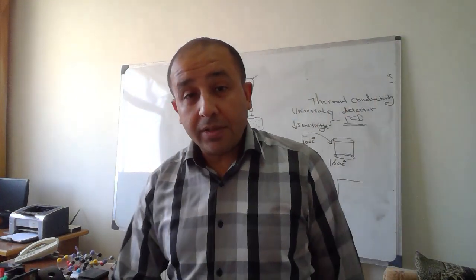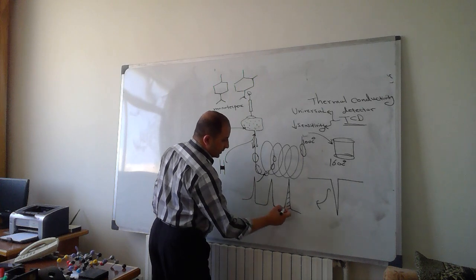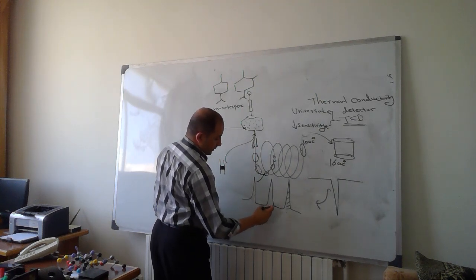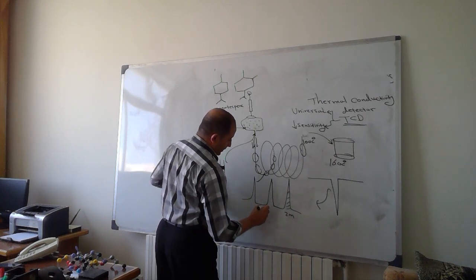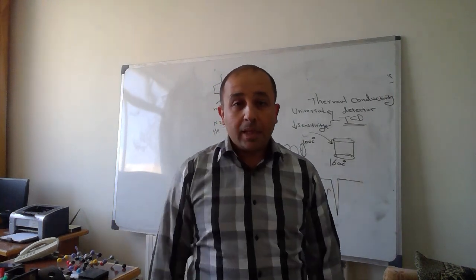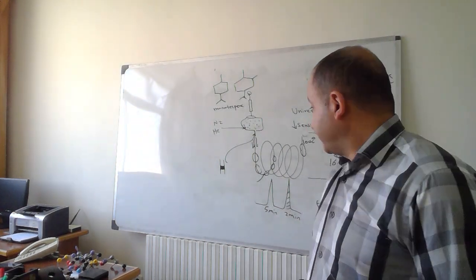Now, if we inject standard material and it has the same retention time of what we are interested in, for example, this one we expect it to be, this is 2 minutes. This is, for example, say 2 compounds, 5 minutes. Okay. Now 2 minutes in our example will be for what? For monoterpene, and 5 minutes will be for metacresol.